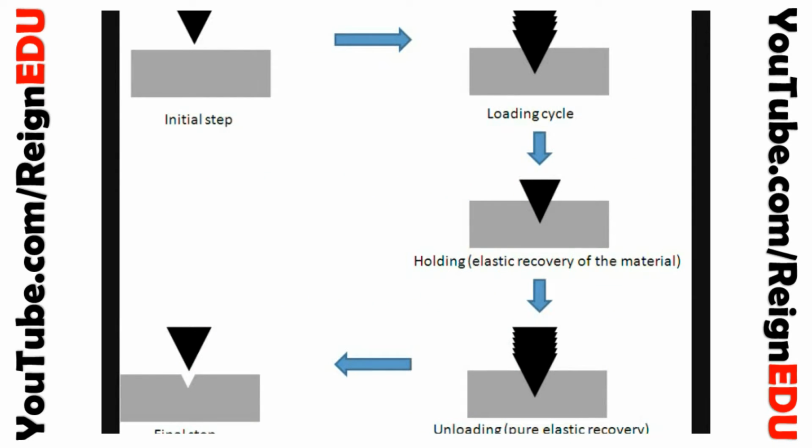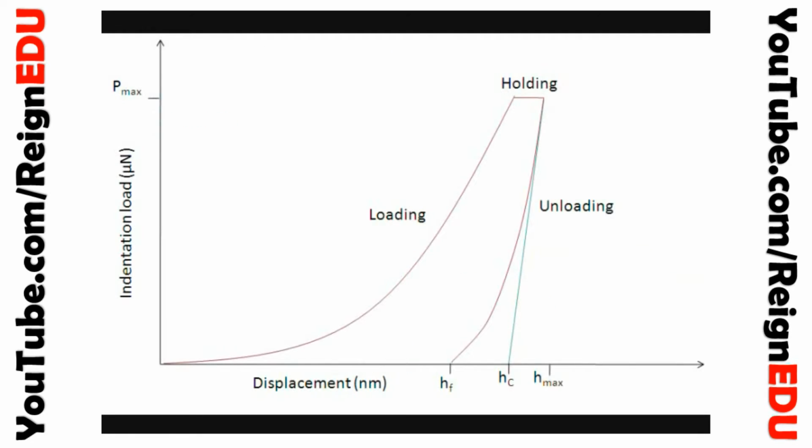At first, the indenter is pressed against the material. After attaining the maximum load, the indenter is held at this load for 2 to 3 seconds so that the material can recover its properties. The indenter is then reverted back, and this unloading is purely the elastic recovery phase. After this, a small impression is seen on the material surface, which is later examined using AFM or techniques like profilometers.